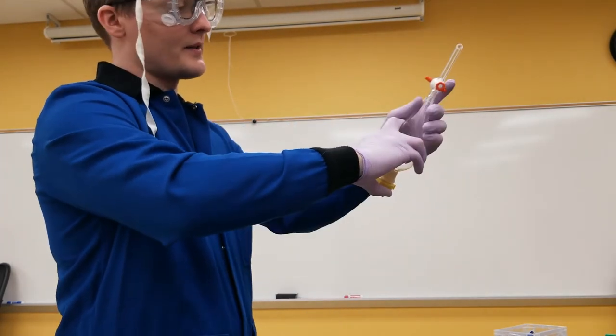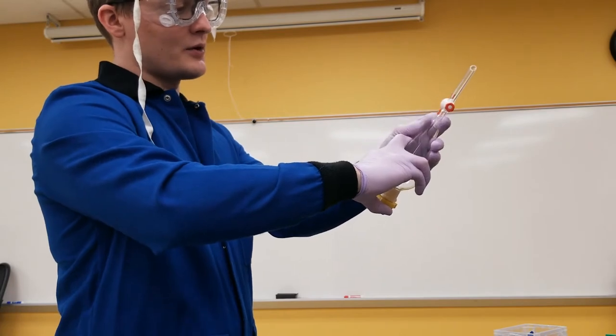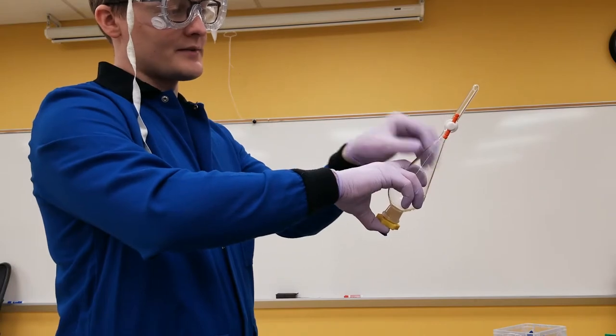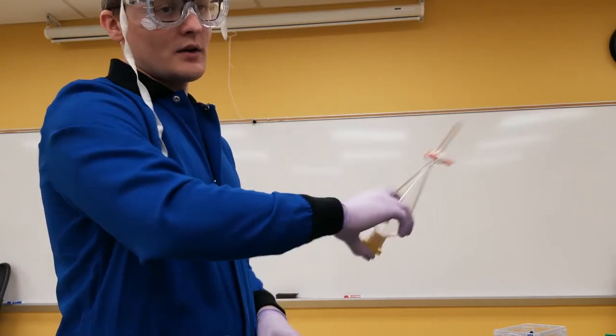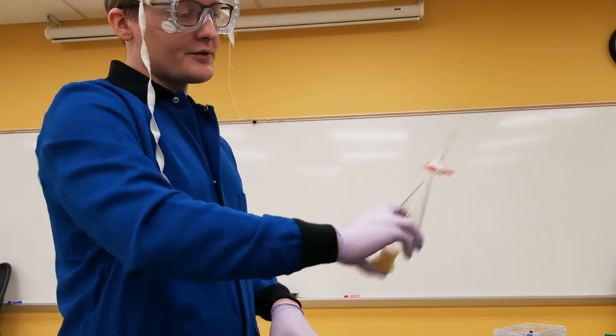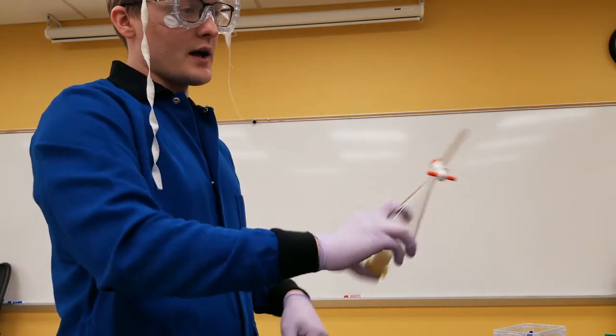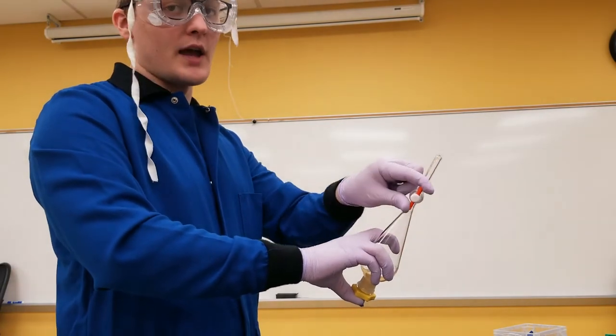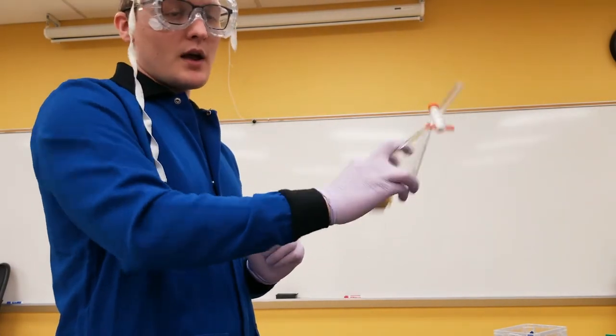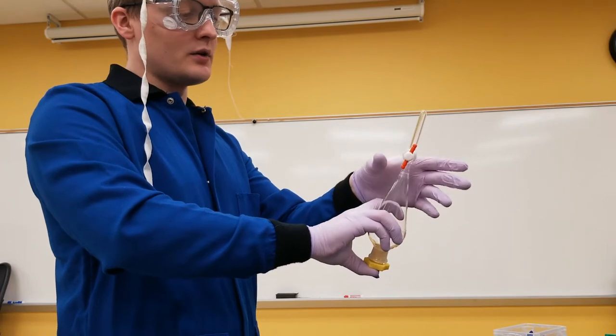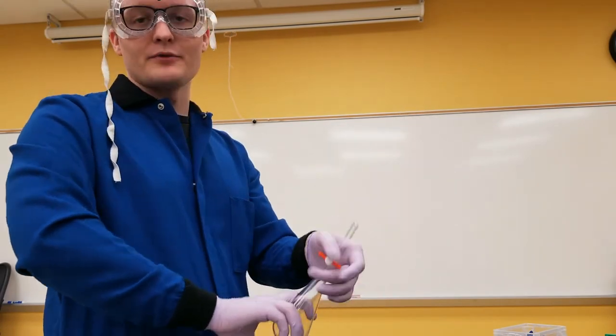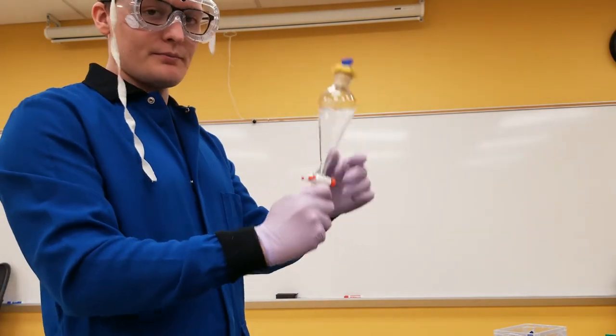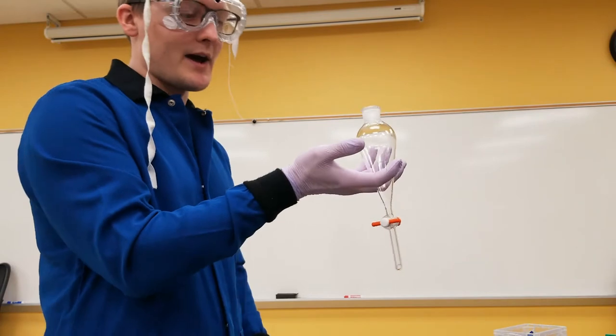While still holding it at the bottom like this, you're going to vent by just leaving that open for a brief second, closing, and continuing to shake. That venting is going to allow even better mixture of the layers and better transfer of your organic and aqueous components. Several shake and vent cycles are going to happen before you're done. Then you're going to bring it upright, set it in its holder, and take the cap off.